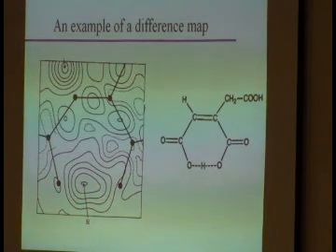Where's the bonding? Where are the electrons? How is the molecule polarized? You can see these things if you collect good enough data. Is that a routine everyday task? No. Are most of you ever going to do that? Probably not. But it's possible. Okay?